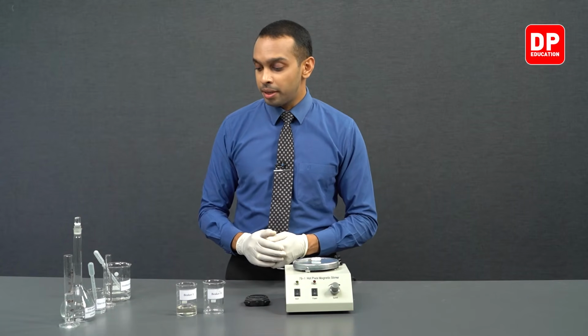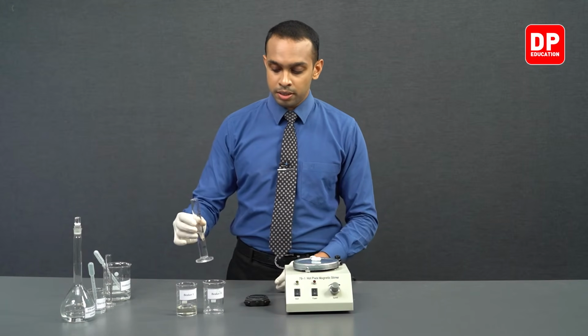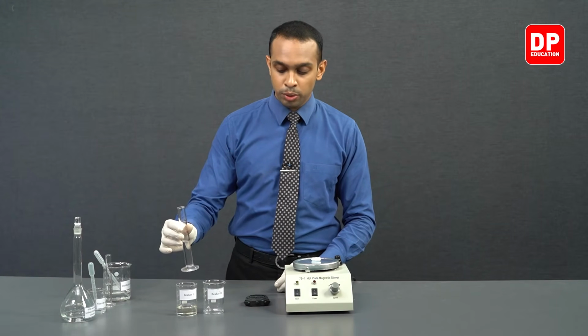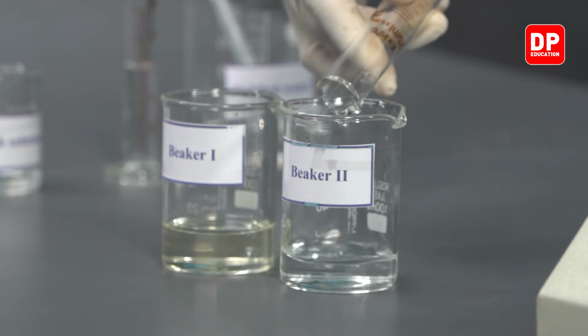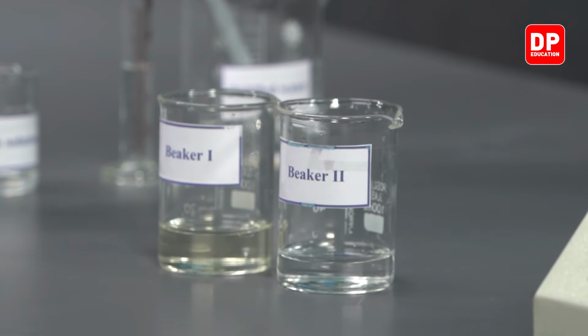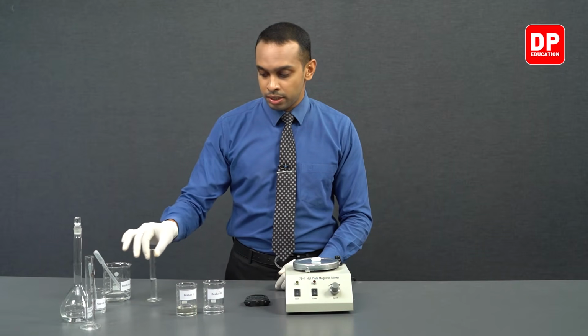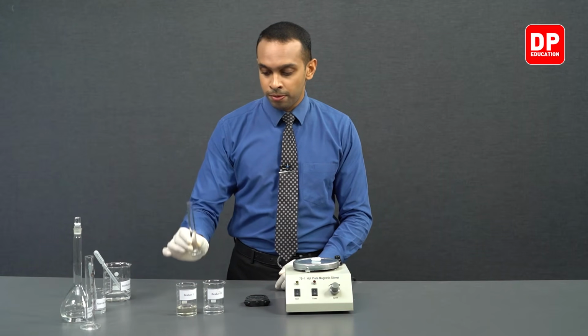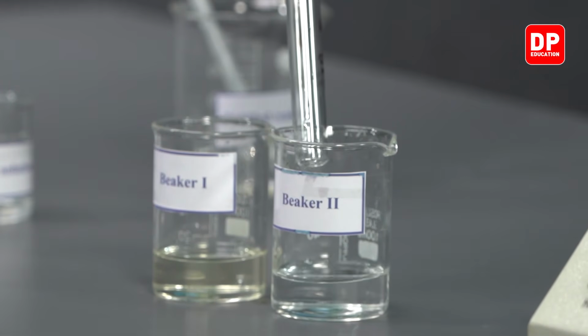So we will be adding 15 milliliters of sodium thiosulfate solution into beaker 2. And then we'll be adding our 6 milliliters of distilled water into beaker 2 as well.